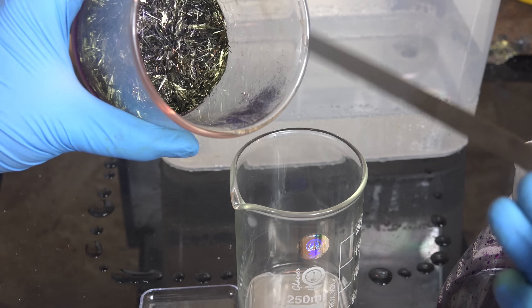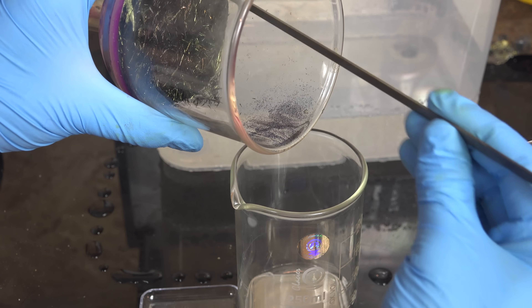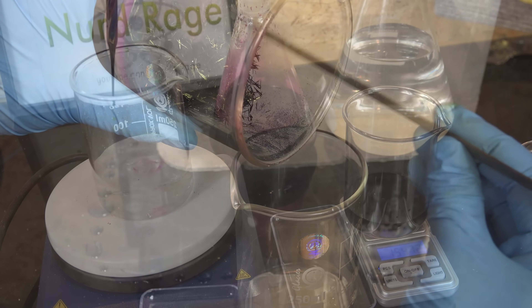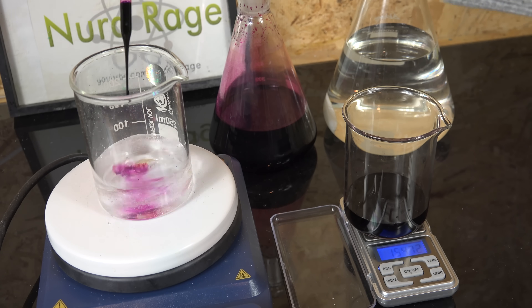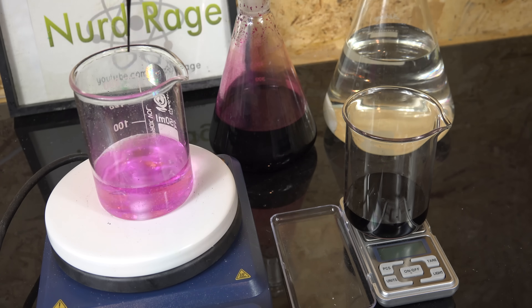Greetings fellow nerds. In this video we're going to make potassium permanganate. It's a useful oxidant and, owing to its strong color, it has special application in redox titrations — as demonstrated when measuring the concentration of hydrogen peroxide.